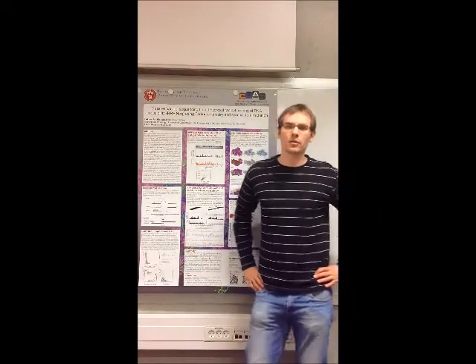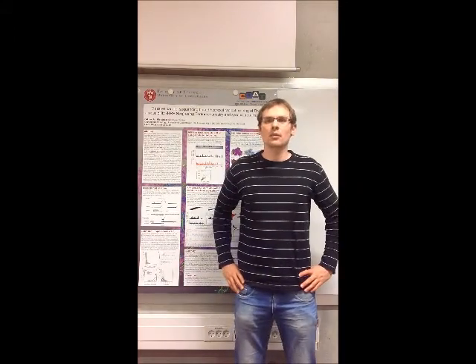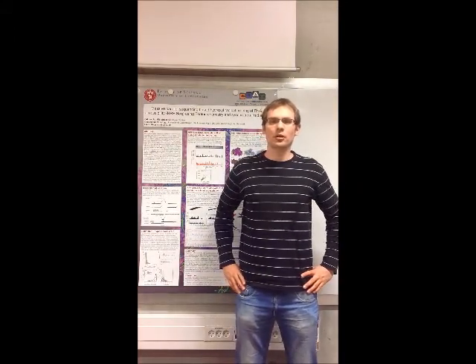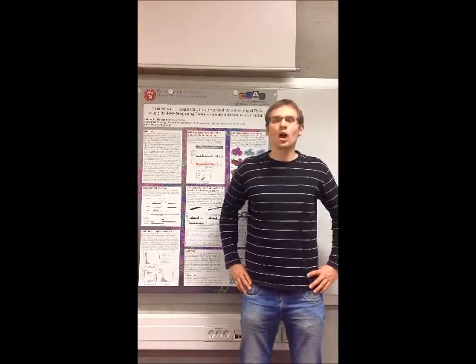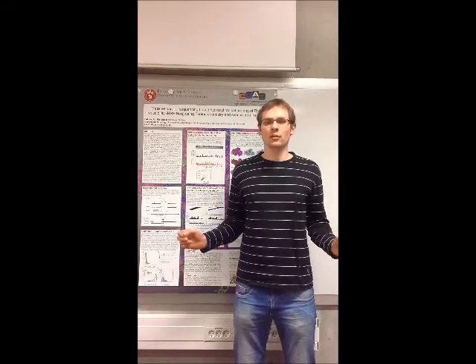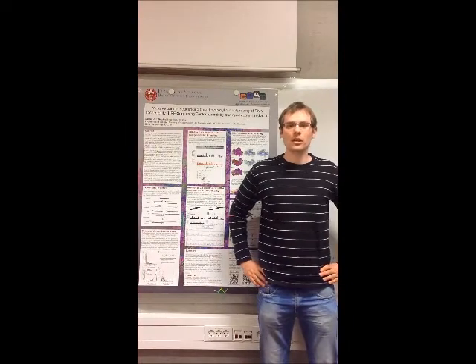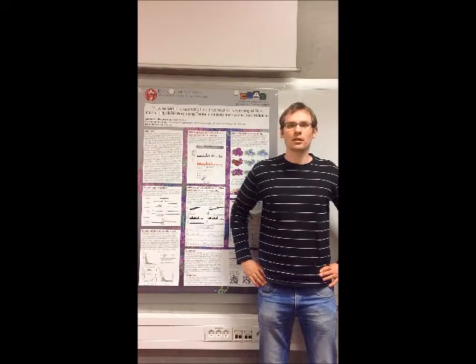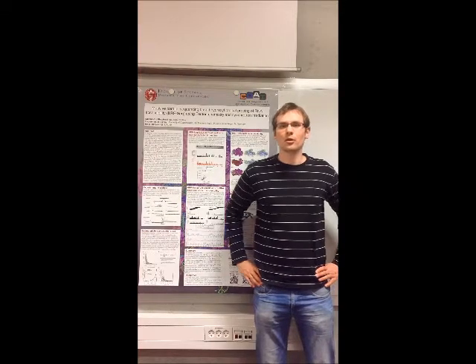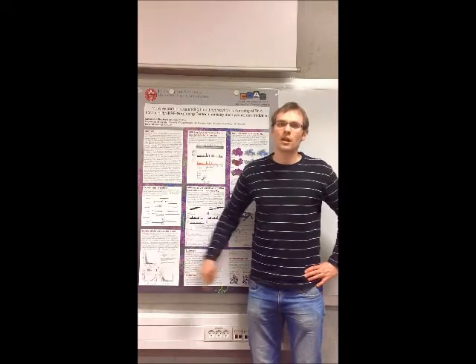Estimated unique counts, or EUCs, of a given fragment are calculated based on the number of unique barcodes observed for that fragment, but correcting for the possibility of independent barcodes having the same sequence. This kind of calculation was proposed before, but required equal probabilities of ligating different barcodes, which is not the case in our experiment.